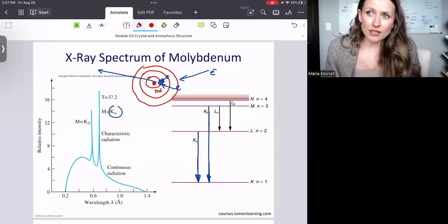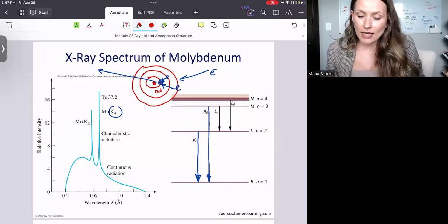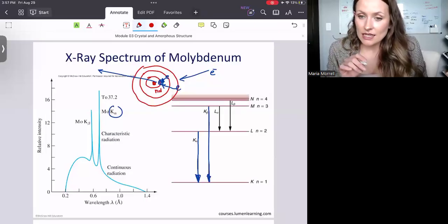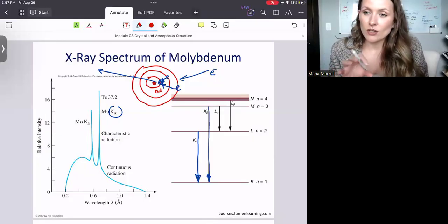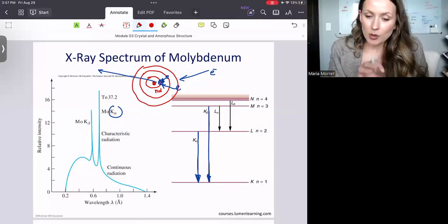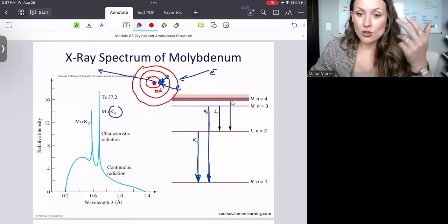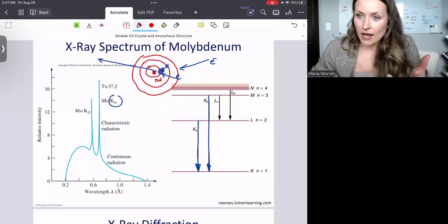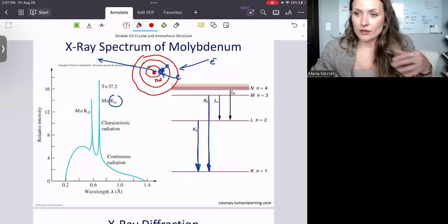There's actually one of the episodes, I do not recall which specific series it was, but they used that specific technique to prove that the composition on the crime scene was identical to the composition of the dirt they discovered in a person's house on their boots. And it's almost like a fingerprint. Perhaps you should think about the spectrum that you're looking at. This is a fingerprint, and every single material, every metal, will have this unique fingerprint.